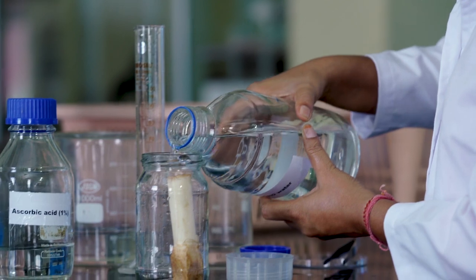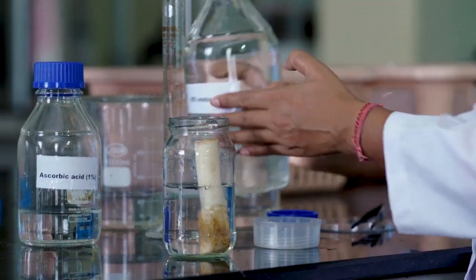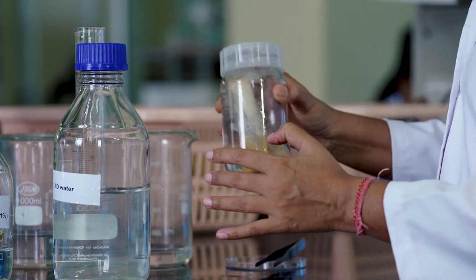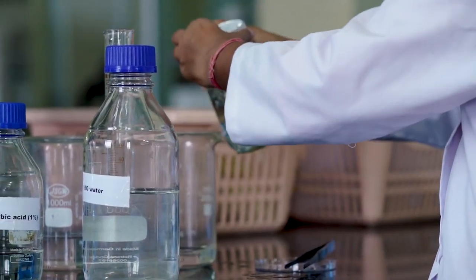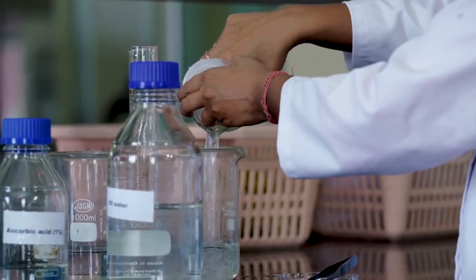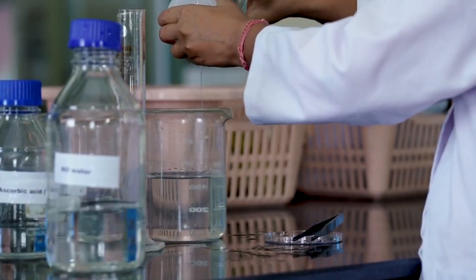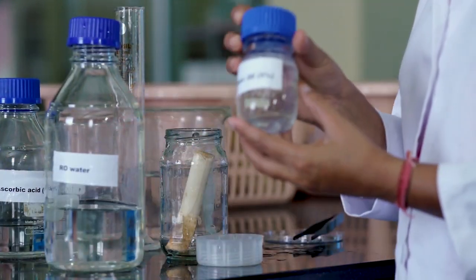As you all know, this process is carried out under very hygienic conditions, so we must ensure that there is no contamination at any level. To prevent contamination in the cultures and in subsequent subcultures, we have to maintain very hygienic conditions. Therefore, washing with sterile water is very essential. After washing thrice with sterile RO water, the explant will be treated with Tween 20.